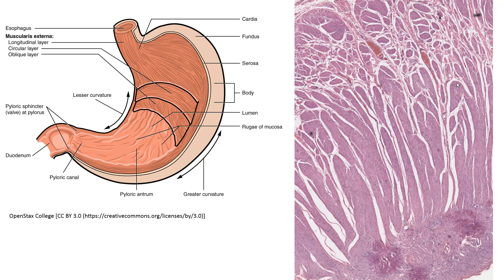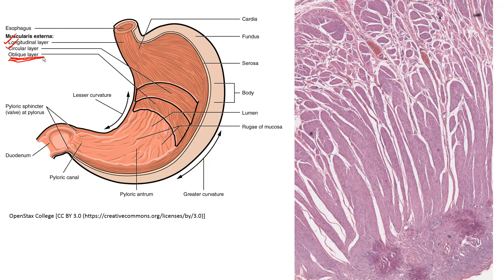Looking at the muscularis externa, in the cartoon on the left we have the outermost longitudinal layer and a circular layer — both familiar — but what we're not used to seeing is an innermost oblique layer. So there's a third layer of smooth muscle in the muscularis externa of the stomach. In the micrograph on the right you can see the borderline between the oblique layer above and the circular layer below, and then one more transition down to the longitudinal layer.